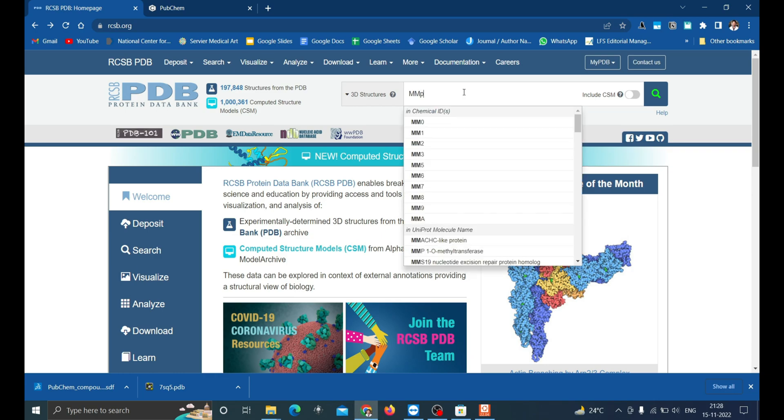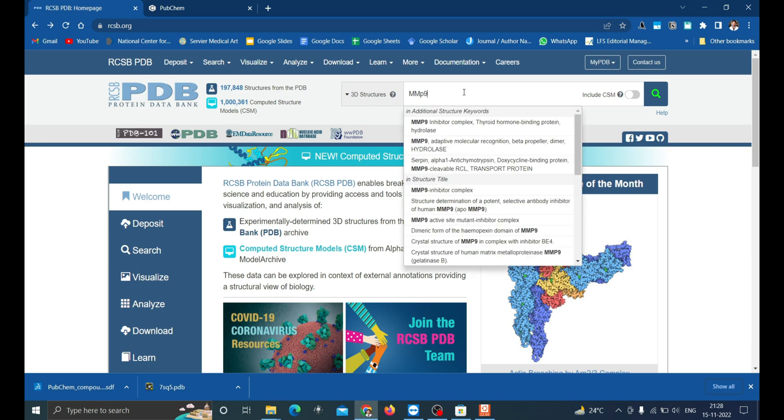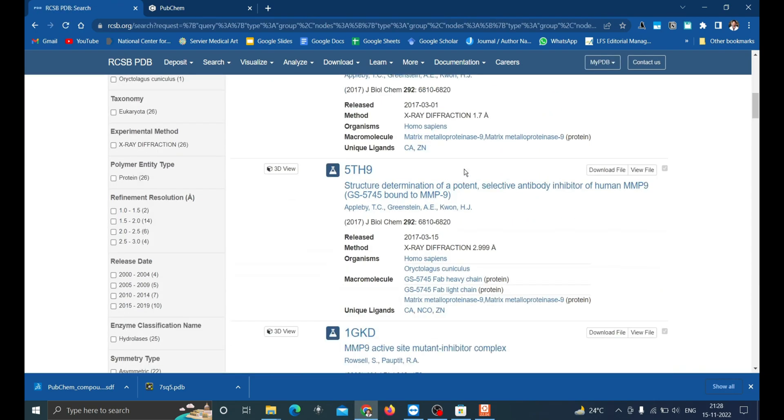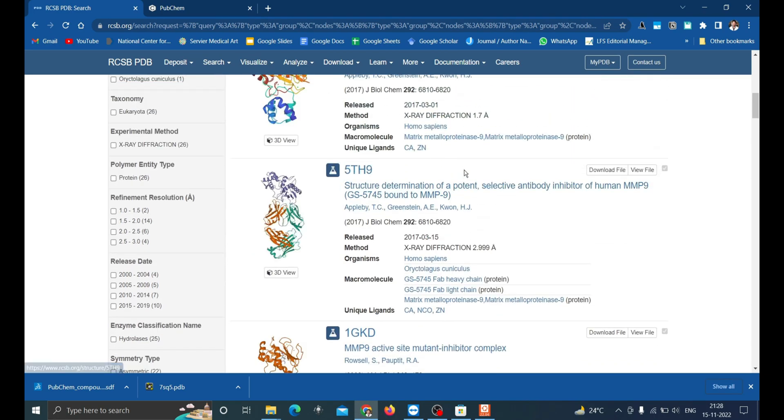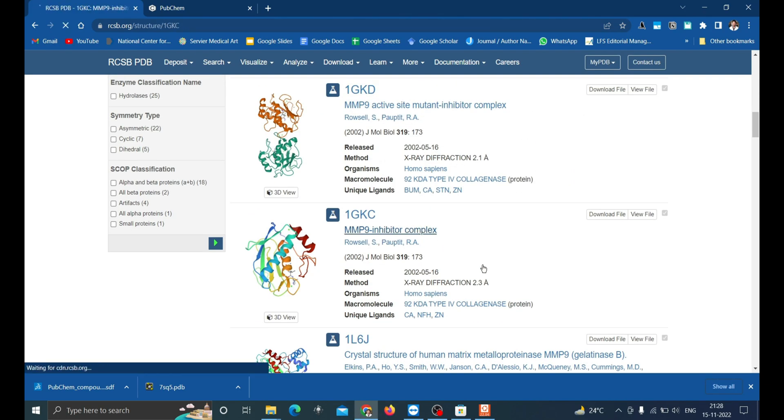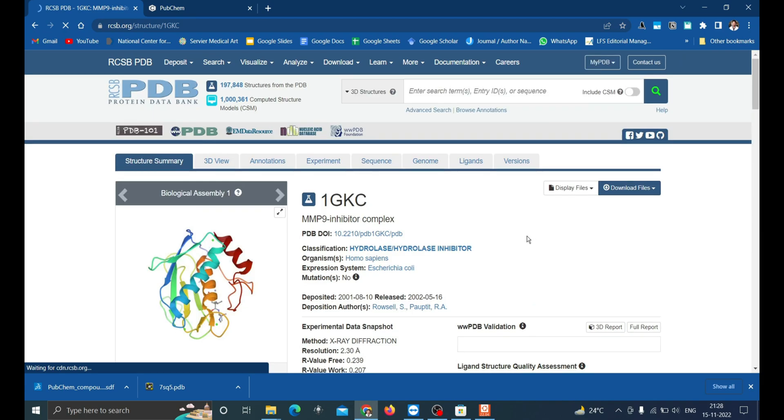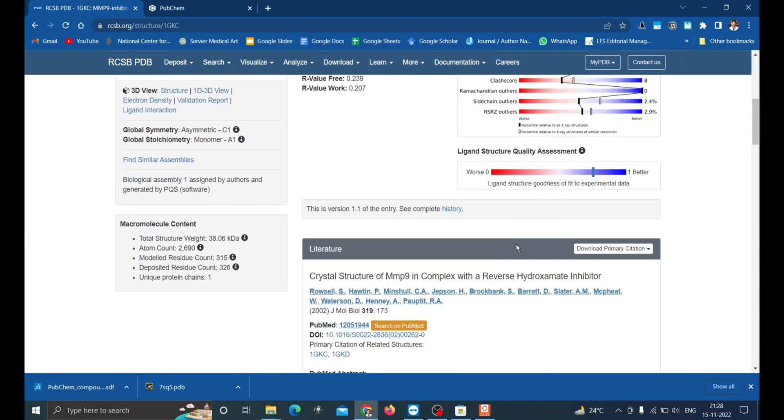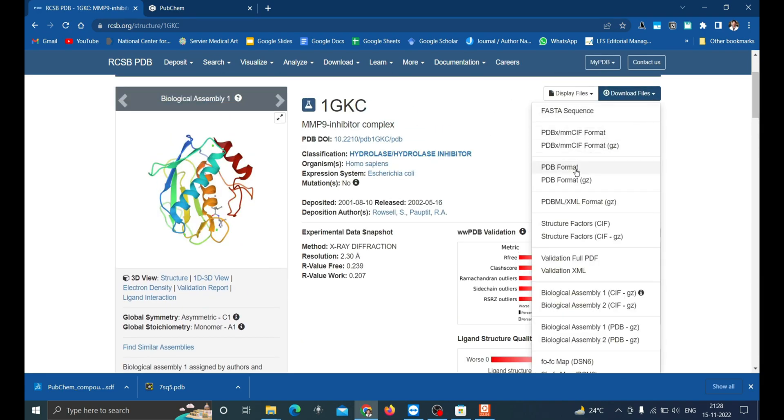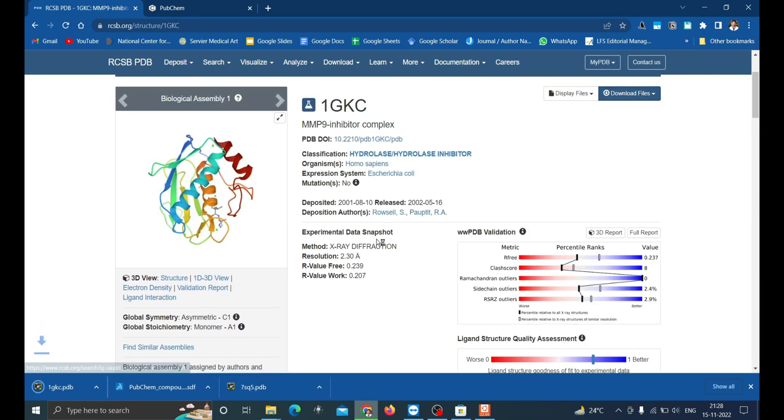Let us take an example of MMP9 protein with which we can dock several compounds. Here I'm going to download MMP9 inhibitor complex. You can find its details and publication. Now click download file and then click on the PDB format to get the protein in PDB.